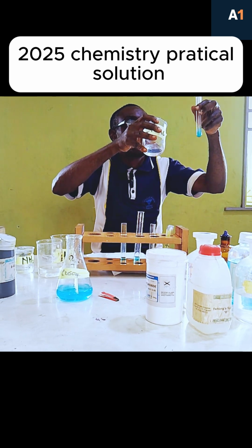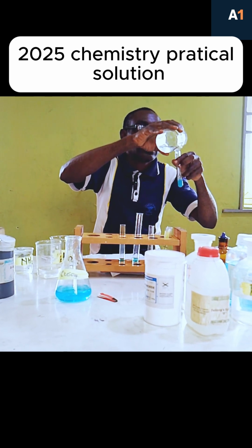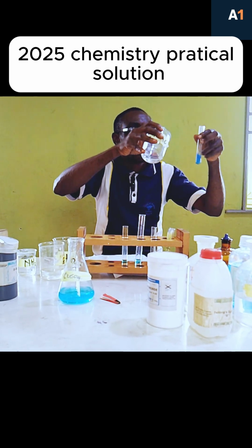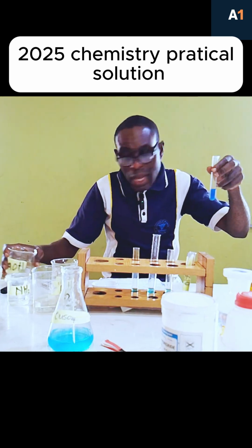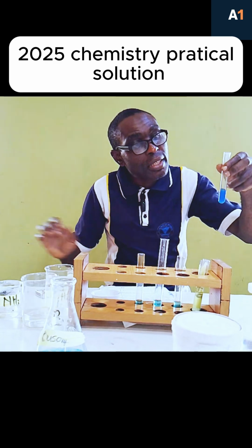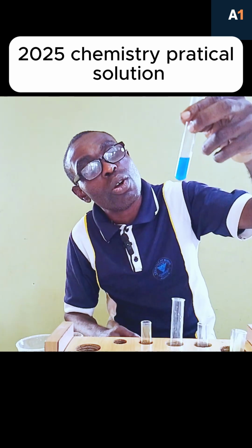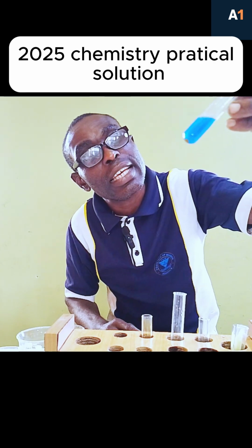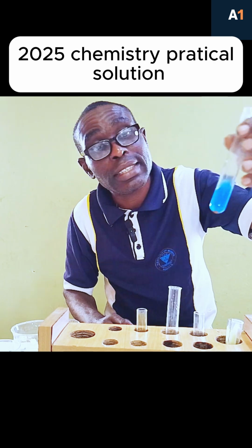This is in drop. So now in excess, you can see in excess. If you look at this one, this is blue, it changed to blue. You can see it turn to blue, but you can see particles there. If you look at the particles, which will be insoluble in drop and excess.